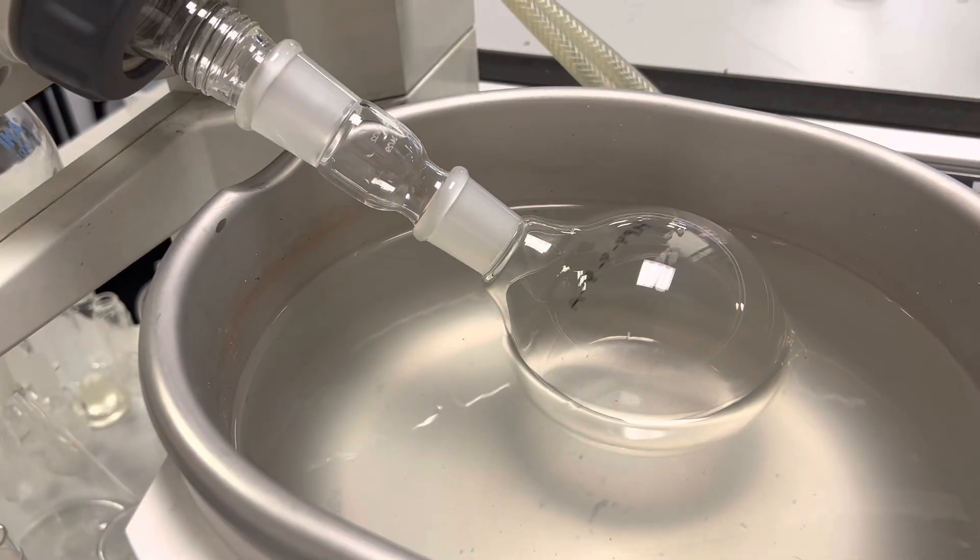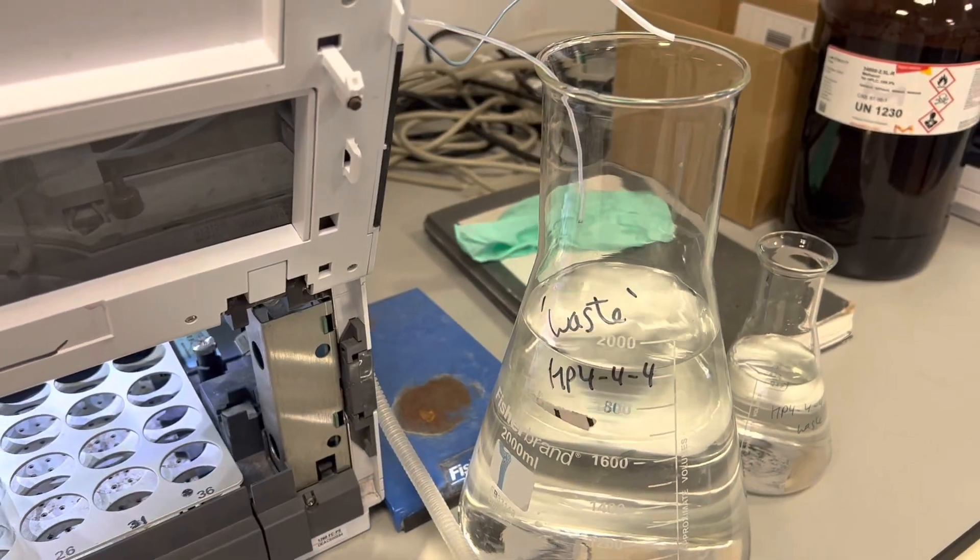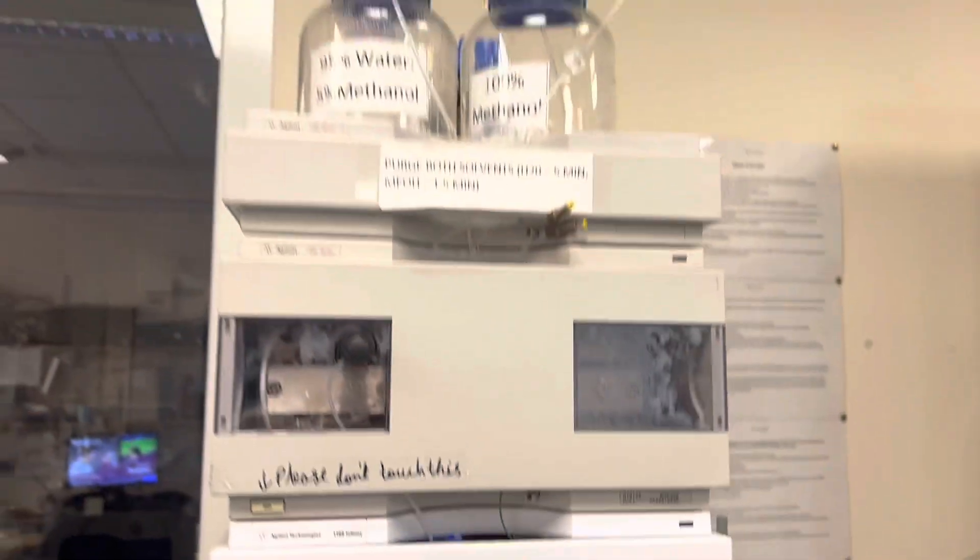Hello, it is Tuesday. I've been in the lab for a few hours now, it's just before 12 o'clock. This morning I started drying some of my samples from the HPLC purification, I also washed the HPLC system ready for the next person coming in at nine o'clock, and I should have been doing some edits for my paper but motivational levels are not very high. I think it's just the last week of university being open — too close to Christmas to actually want to get things done. To combat that, I'm going to dry my samples a bit longer and then go home and work on the paper edits from home, because I'm not getting anything productive done here today. I think tomorrow is going to be my last day in the lab because your girl needs a break.